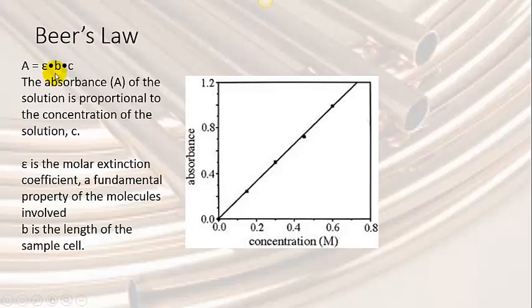So this is absorbance equals some number times concentration. Since this always stays the same, these are proportional. This looks an awful lot like a linear equation. Y, on the y-axis, equals the slope, this number, both of these multiplied together, is just a constant, and this is the slope of the line, m.